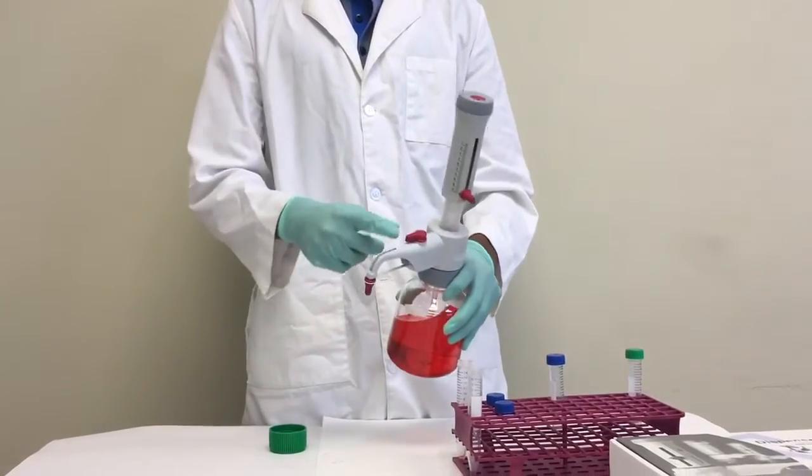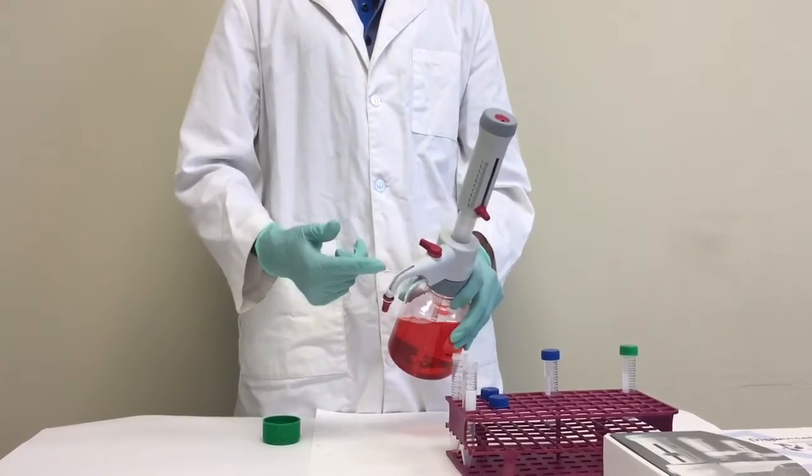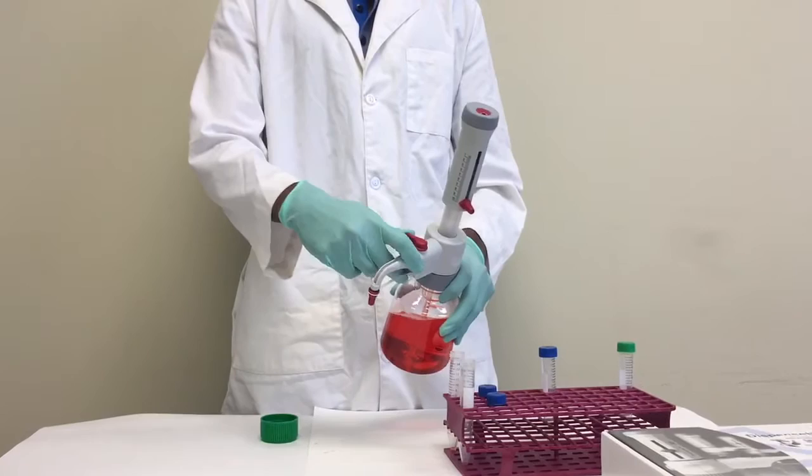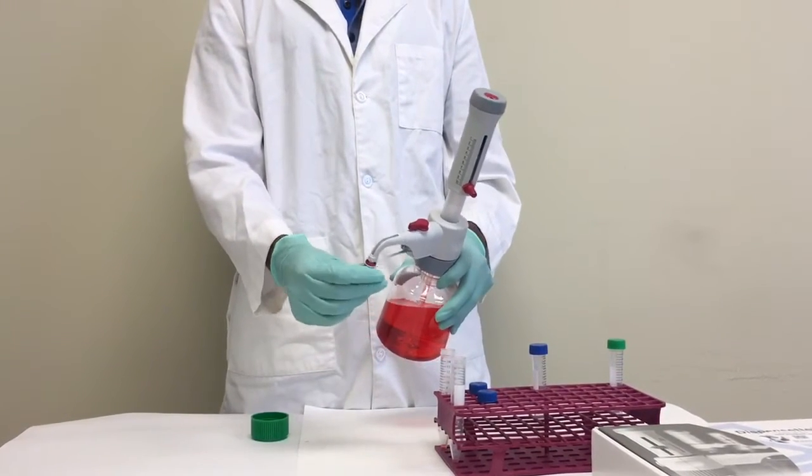Before you dispense, make sure you prime the instrument by switching the recirculation valve to the side, which allows the liquid to recirculate back into the bottle so you can prime without splashing or loss of liquid, which helps increase safety.